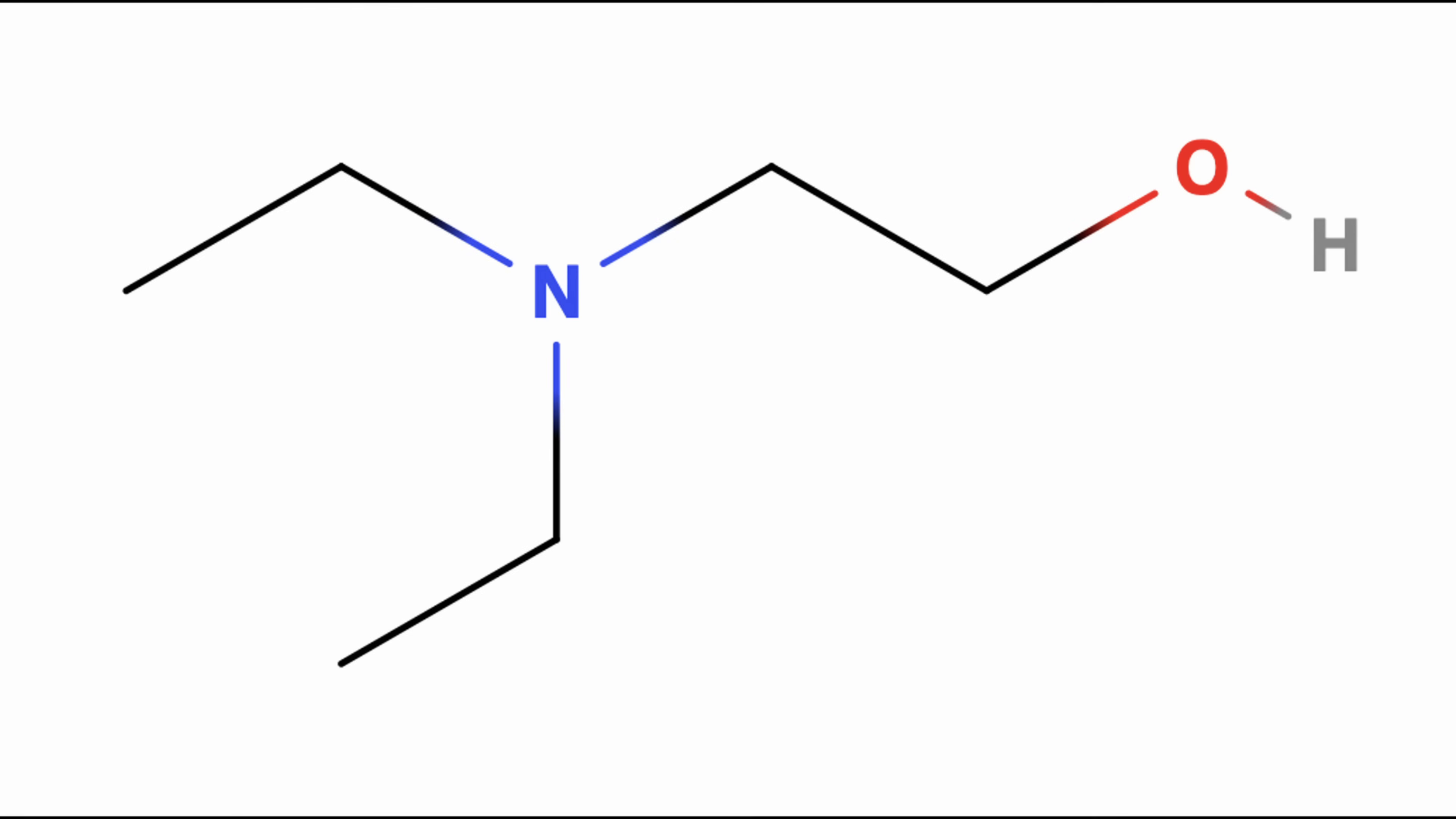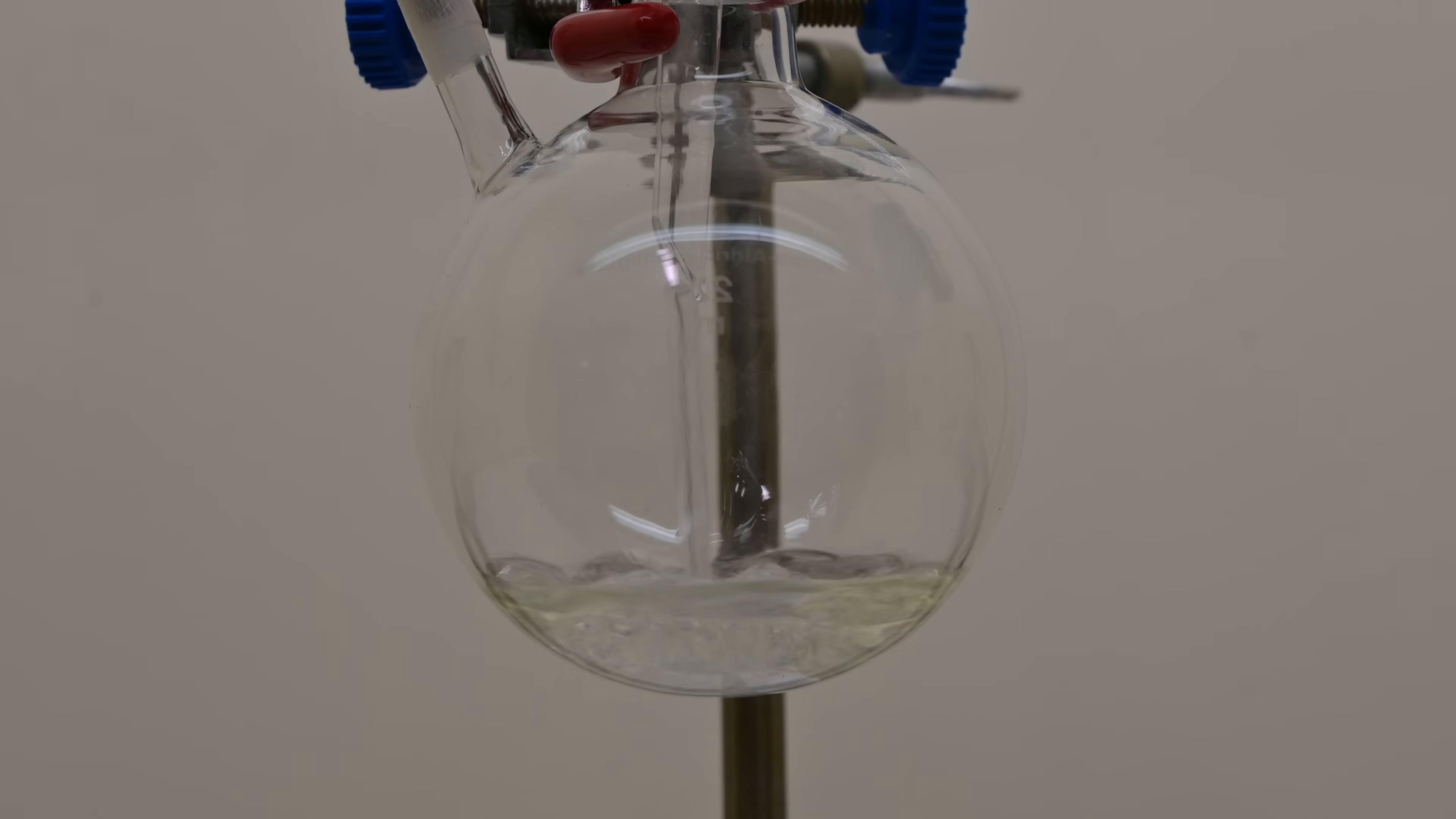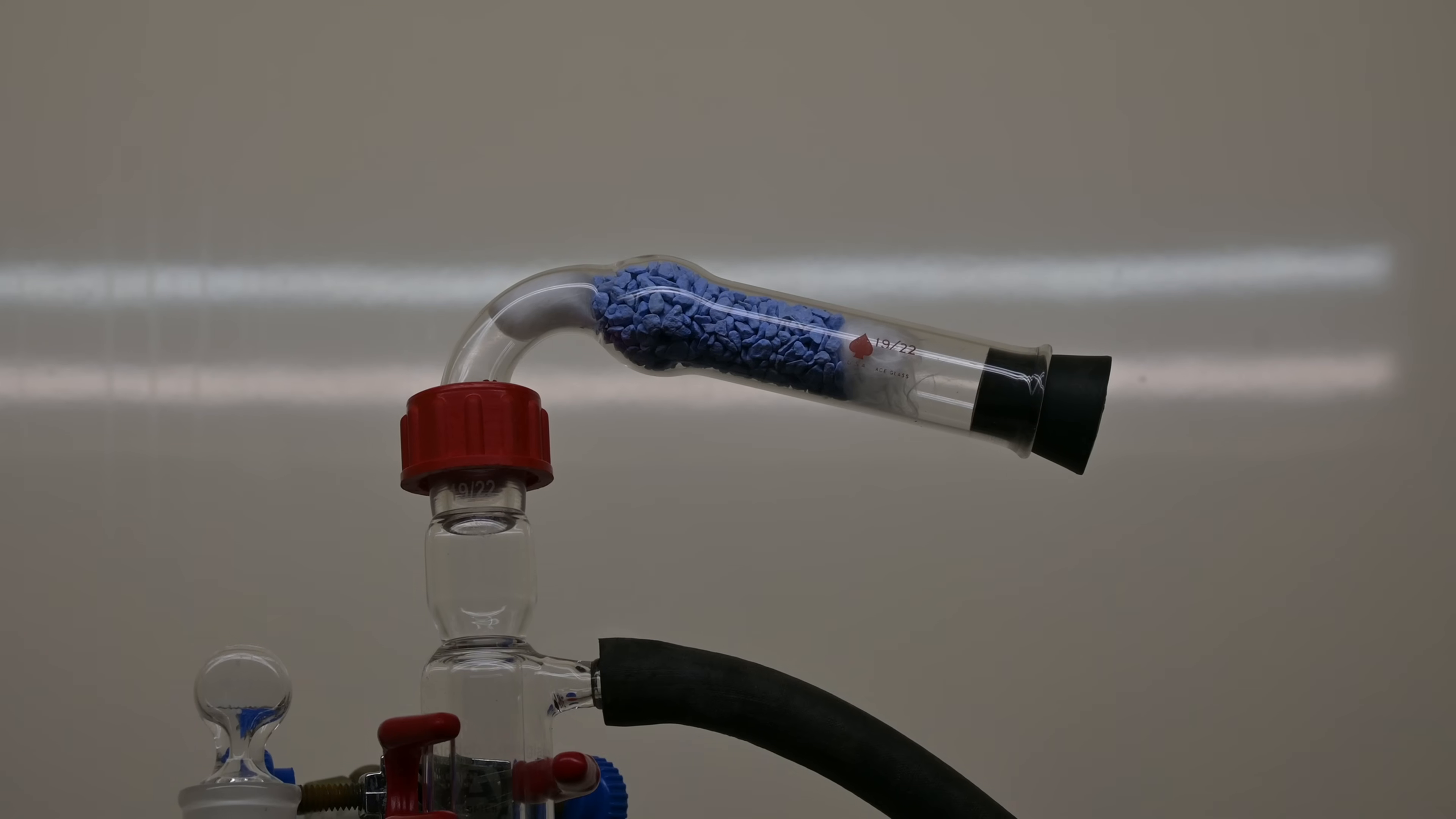First we need diethylaminoethanol to replace the ethanol in the benzocaine. To synthesize this, I begin by adding 38 grams of diethylamine into a 250 milliliter round bottom flask. I then fitted the flask with a reflux condenser and a dropping funnel. I used a claisen adapter so I can have multiple attachment points. Attached to the reflux condenser I have a drying tube to protect the reaction from atmospheric moisture.